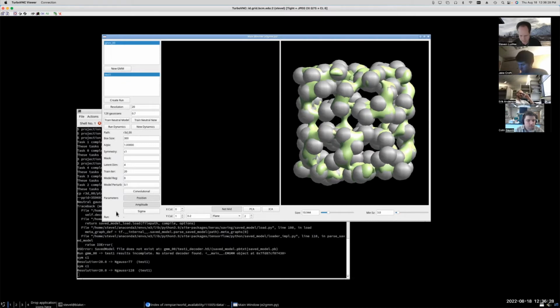I assume it just wasn't useful. There's a practical reason and a mathematical reason. The practical reason is it's just not really very useful. It kind of goes against the whole idea that you're picking a length scale that you want to look for changes in, and you want to consider a certain coarseness of resolution. So you want to set the Gaussians to be some size, and that's going to define the level of features you're looking for.